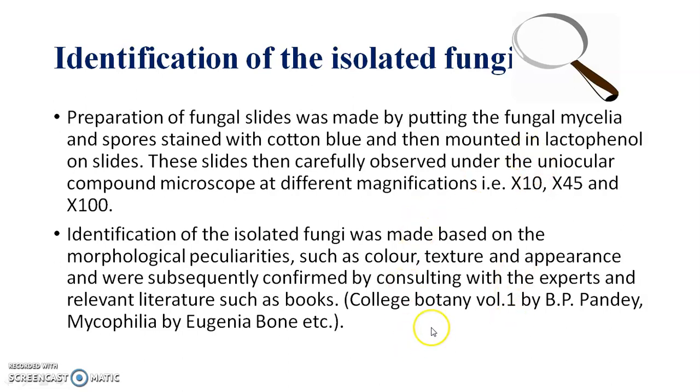Identification of the isolated fungi. Fungal slides were prepared by putting the fungal mycelia and spores, stained with cotton blue, and mounted in lactophenol on slides. These slides were then carefully observed under the uniocular compound microscope at different magnifications, that is 45x and 100x. Identification of isolated fungi was made on morphological peculiarities such as color, texture and appearance.